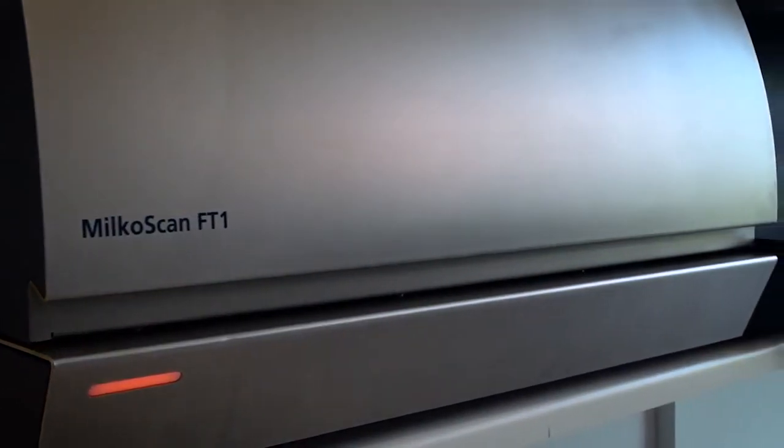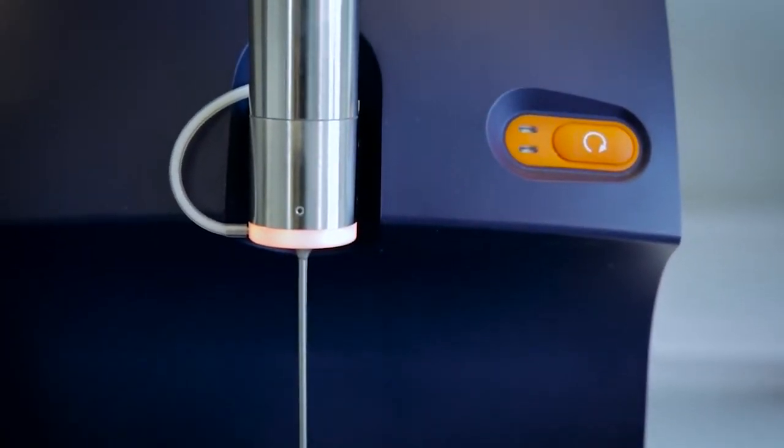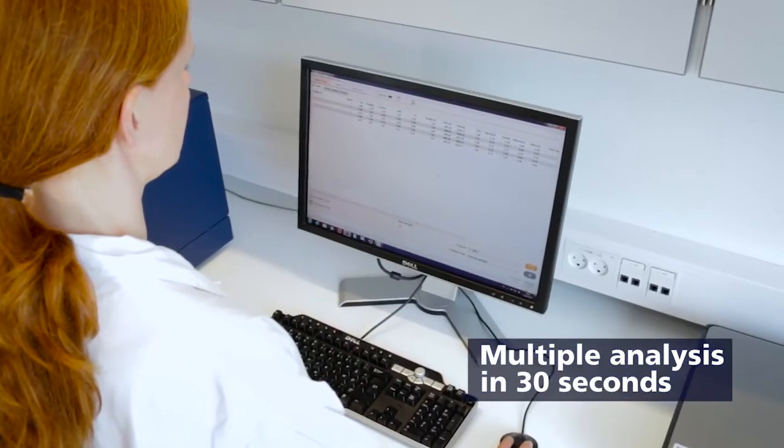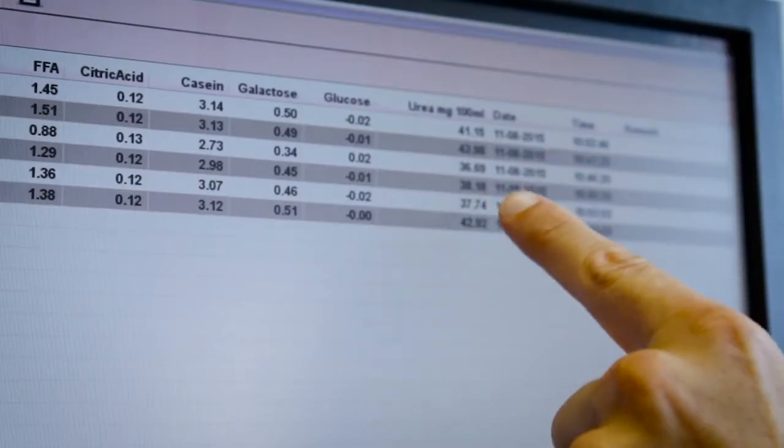Milcoscan FT1 is the gold standard in dairy analysis, using FTIR technology to analyze 14 milk components simultaneously, including screening for adulterants in 30 seconds. This enables you to make fast adjustments in your production.